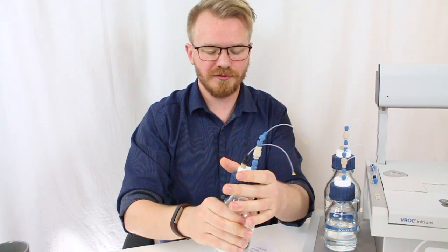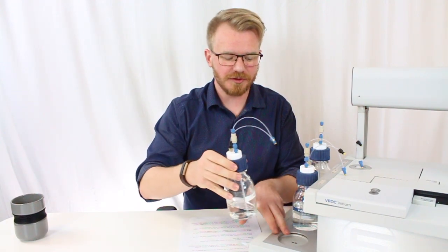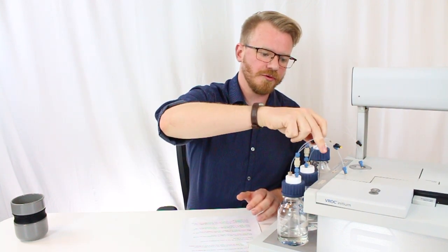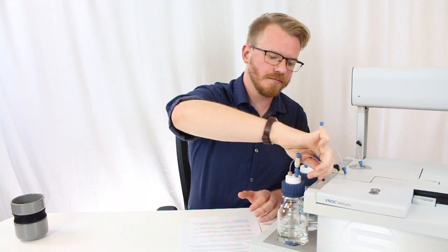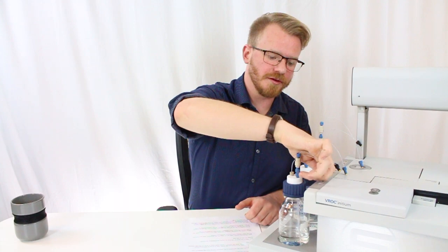Once you replace your solvent, gently put it back on the instrument onto the holder. There are weight sensors in here that could be potentially damaged. Rescrew in the solvent lines. And the order doesn't matter on the way on replacing them.